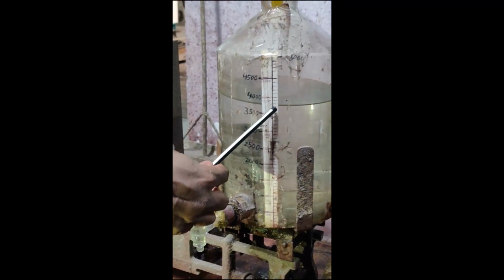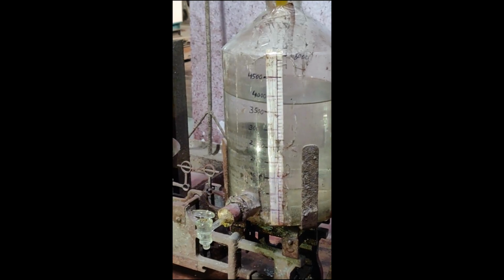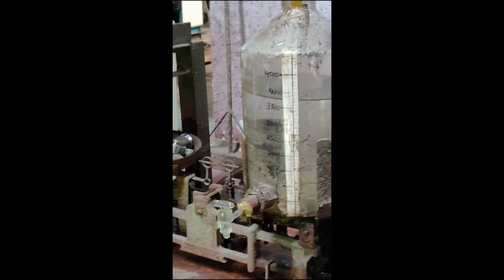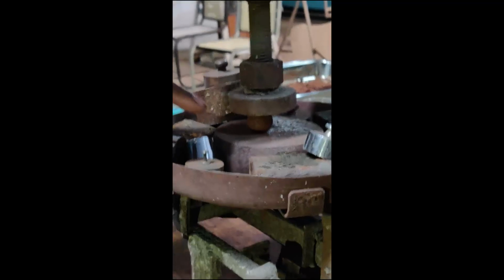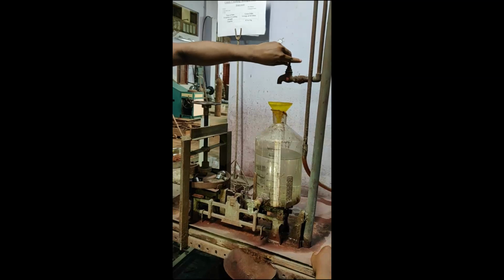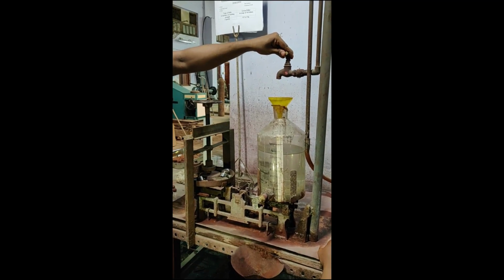So initial reading 3750. Now pellet is already in contact. Now pellet is in between these two plates. Now we are filling the water slowly and applying the force on the pellet.